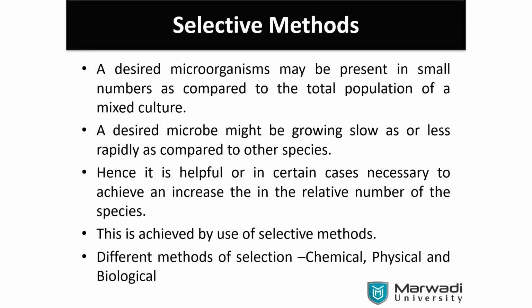Okay, dark spots are there. Some are yellow or filamentous. Every sort of thing is there. Very good, you got lots of things. You can just pass it out. It is random. Maybe your name is there or not, not a problem. But don't open it.